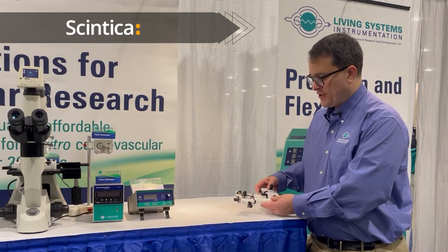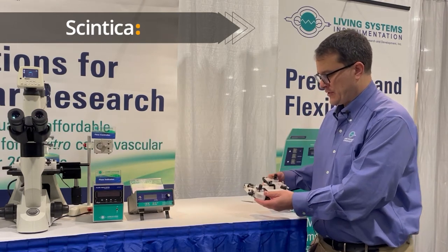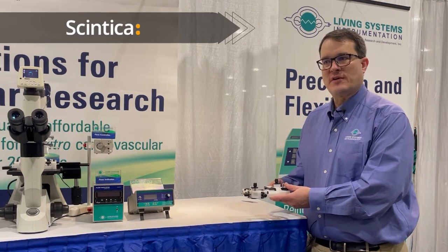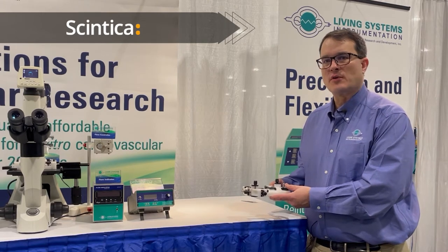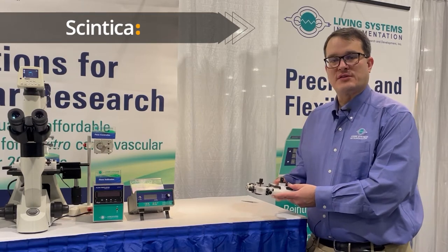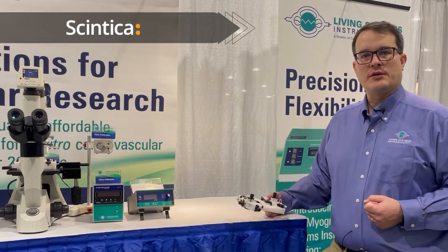This is a specialty chamber that we just released very recently and this chamber is used for applications of large blood vessels, carotid artery, femoral artery, aorta even, as well as non-vascular tissue such as small intestine or colon.